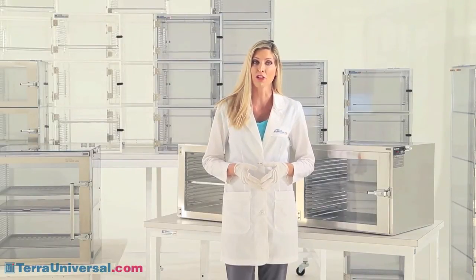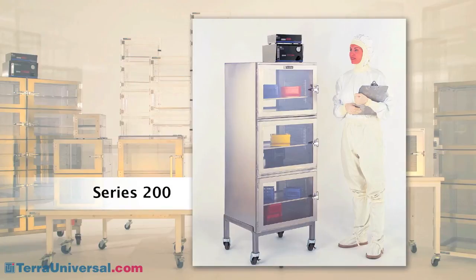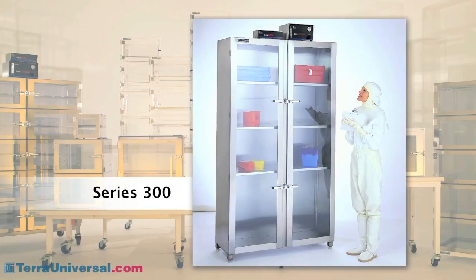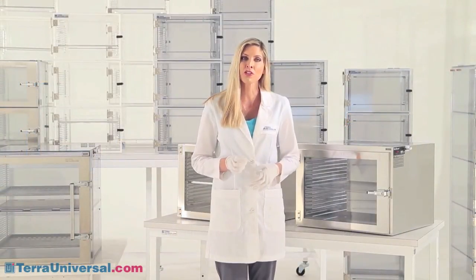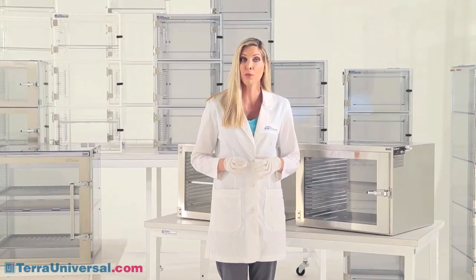Terra offers several other stainless steel chamber configurations. The series 200 stainless steel desiccator features double-wall construction with built-in gas plumbing for easy connection to Terra's dual purge and nitro watch systems, and an automatic relief bleed valve in each chamber. The series 300 provides a large open storage area with adjustable shelves, perfect for high-capacity requirements or bulky items. The series 400 provides a multi-chamber cabinet configured for use with Terra's top-of-the-line NitroPlex humidity controller, allowing chamber-by-chamber RH monitoring and control. Visit TerraUniversal.com for more information on Terra's automated humidity control systems.